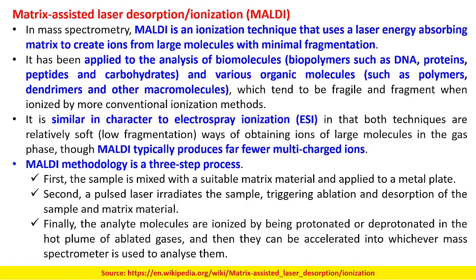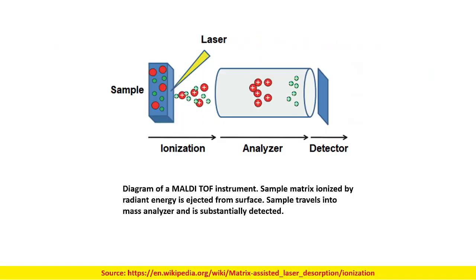Then MALDI, matrix assisted laser desorption ionization. As I told you, we are having a laser, a high powered laser. It is used to ablate the sample which is embedded within a matrix, and then it enters into the analyzer, and then it goes to the detector.